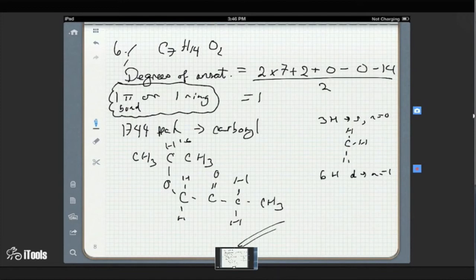It's on a carbon that's adjacent to an oxygen, so it's going to be between 1.5. So yeah. Okay, so let's go back to... Well, it's 8.5 and 4.5. No, that can't make sense. So its shifting should be between 2.5 and 4.5, right? Now, remember I said those rules can be nudged a little bit, but this is way off. That's way off. Not even close.